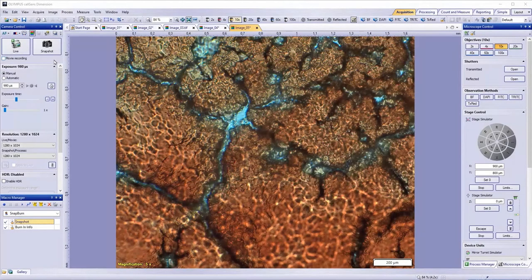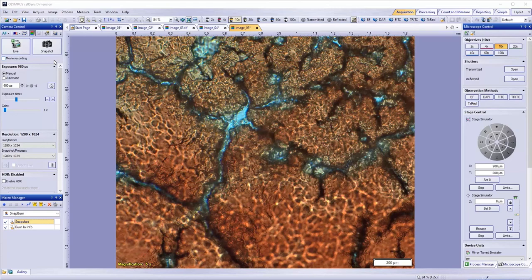In this video, I'll show you how to use CellSense software's naming and saving tools. First, I'll show you how to customize the way acquired images are named.